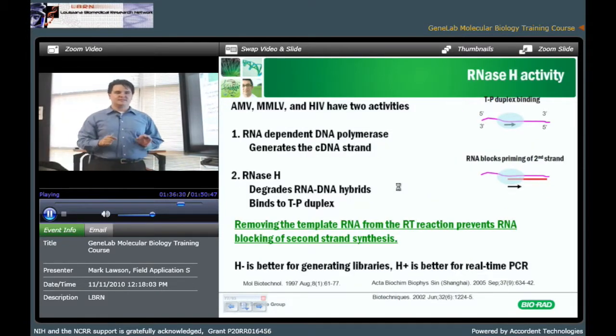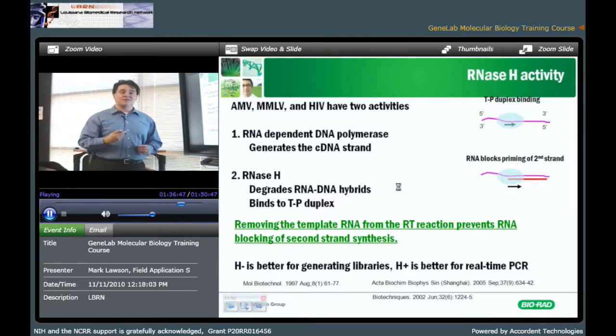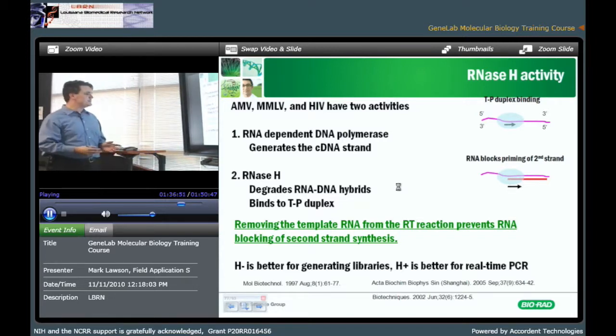Very, very important. This is the one element that is the most common mistake people make. There's a particular commercial RT kit called Superscript, and it's from Life Technologies. And it was designed for a time when cDNA libraries were the hot, cool new technology. And it was designed specifically to give full-length transcripts so that they could be copied into clones and create a transcript library. Right? We don't have that same application need anymore.